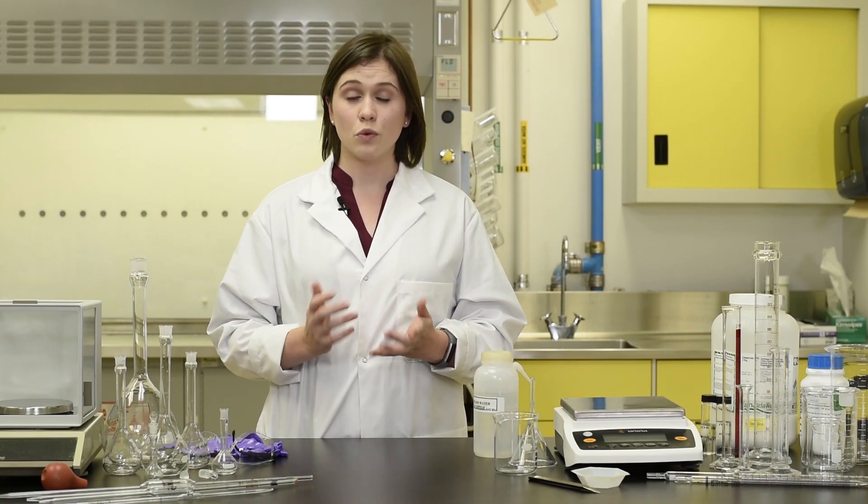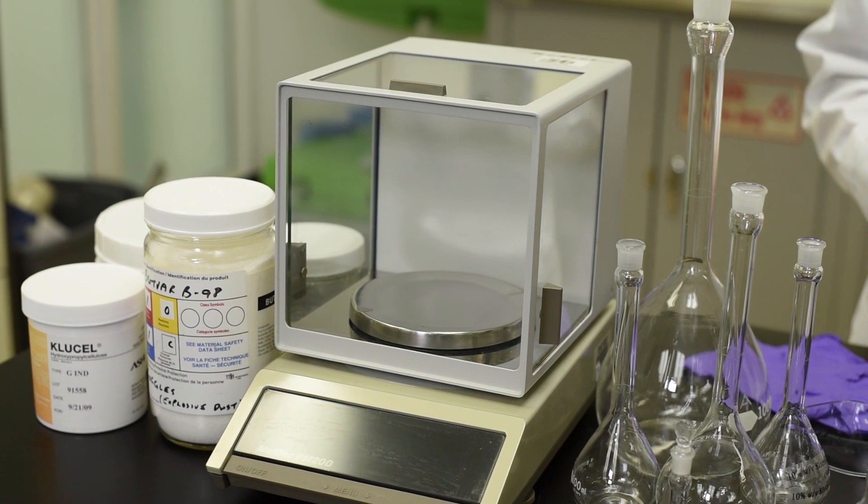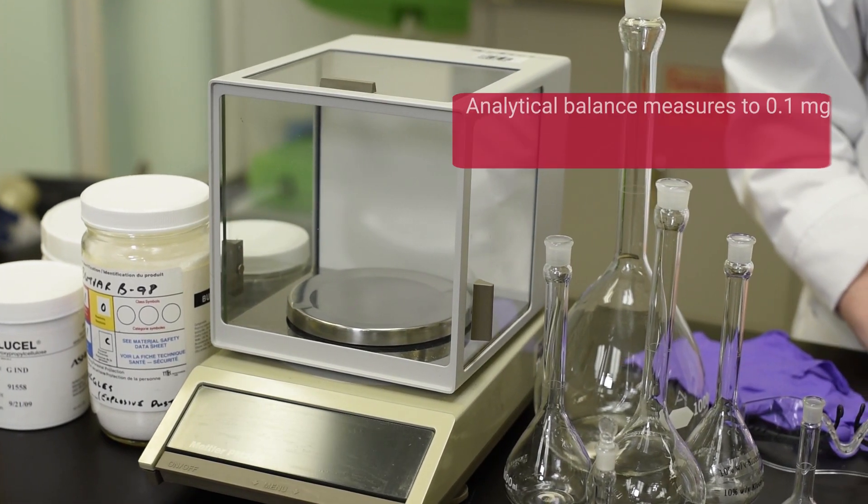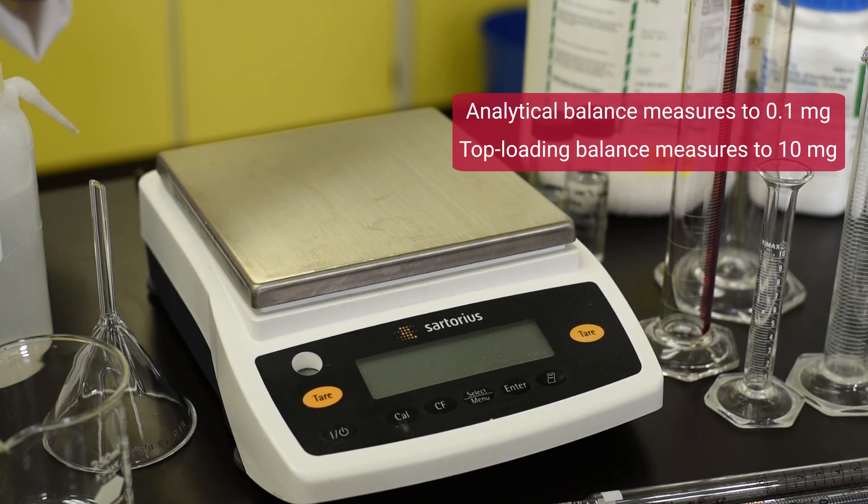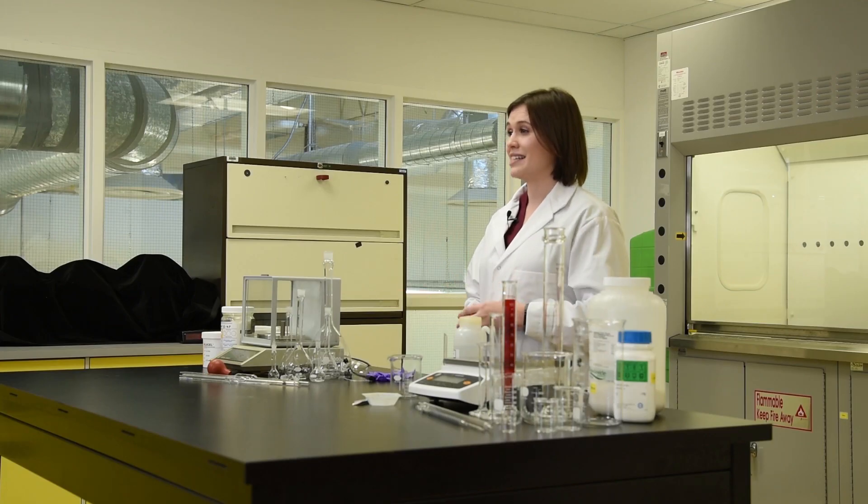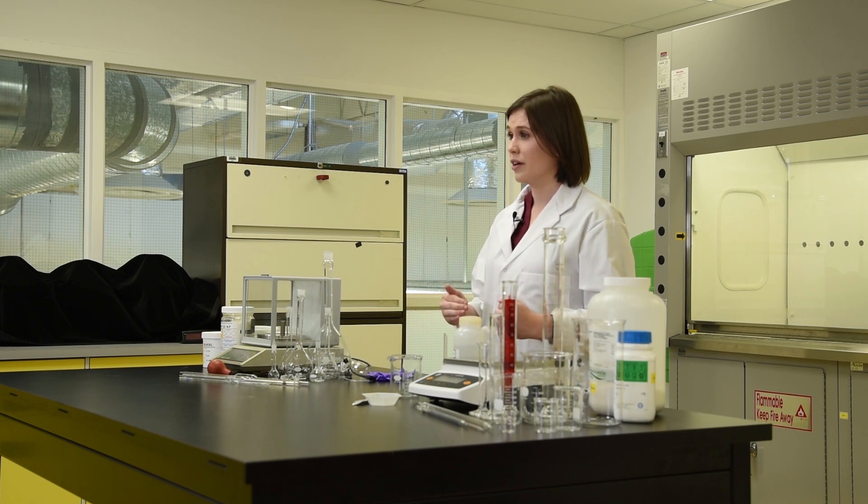When it comes to weight measurements, analytical balances like the one here are more precise than top-loading balances. This analytical balance can measure to 0.1 milligrams, whereas this top-loading balance can be used to measure to 10 milligrams. An analytical balance is best for situations requiring a high degree of accuracy and precision, for example when creating standards for desalination measurements.